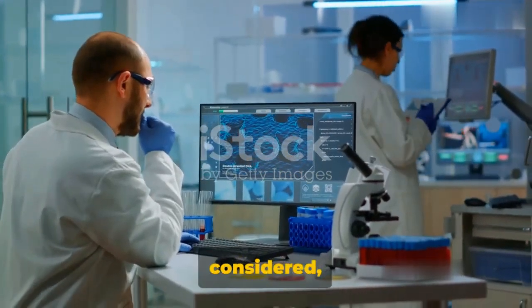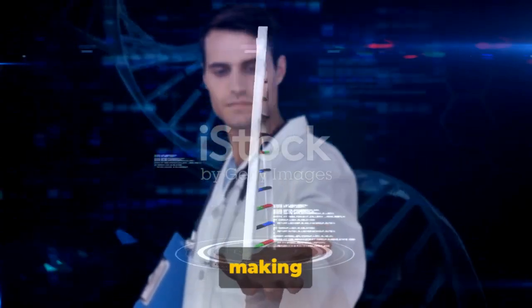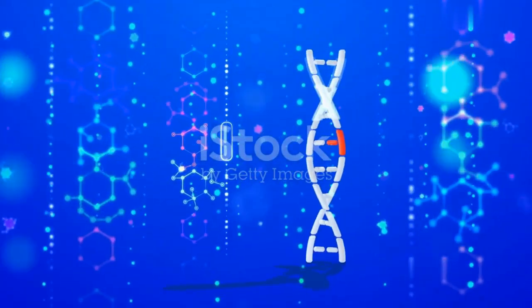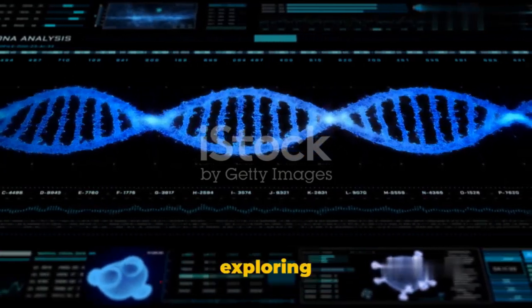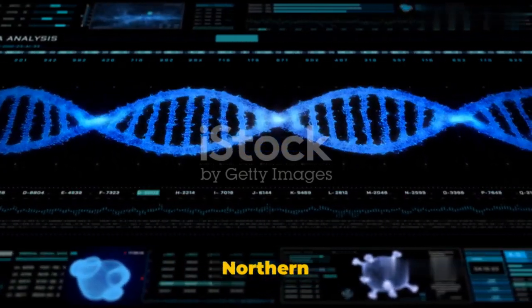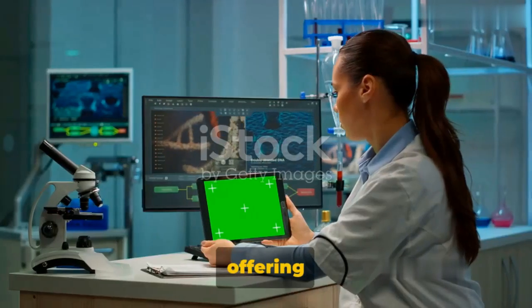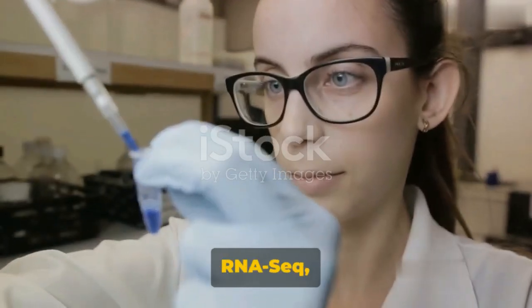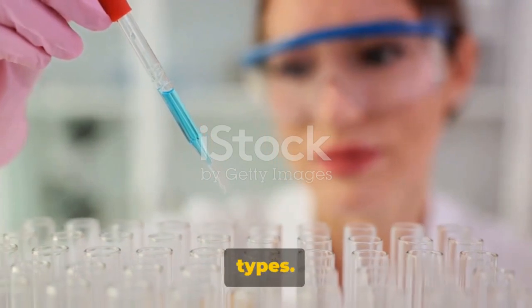But all things considered, RNA-seq provides a comprehensive view of the transcriptome, making it a powerful tool for gene expression measurement. So there you have it. We've journeyed through the fascinating world of measuring gene expression, exploring 4 compelling methods: northern blotting with its simplicity and cost-effectiveness, qPCR offering real-time data and ease of use, microarray enabling high-throughput analysis, and finally RNA-seq providing a broader range and the ability to detect various RNA types.